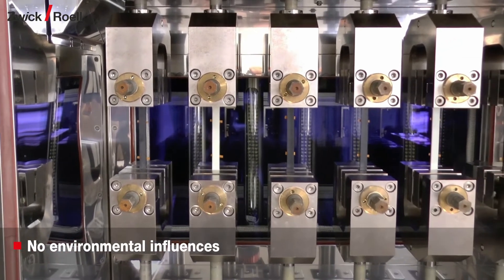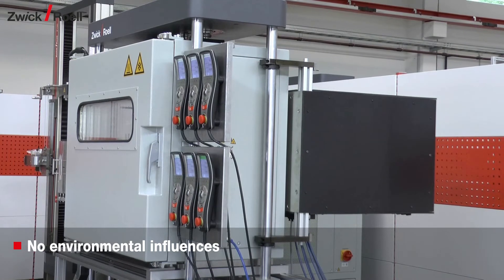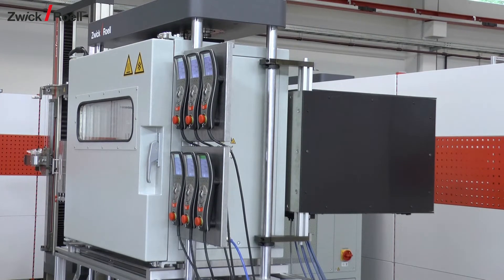In order to get repeatable results, environmental influences must be minimized. The video cameras are therefore enclosed in a separate housing that is attached to the rear of the machine.